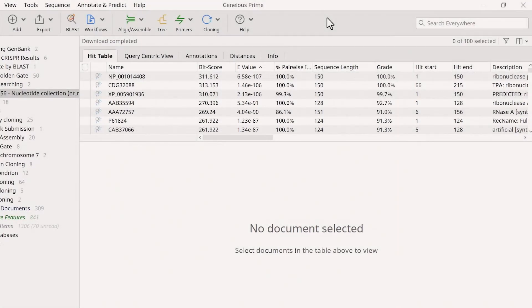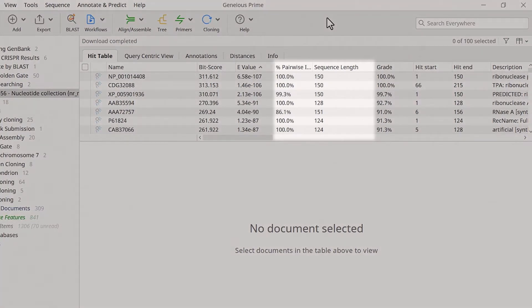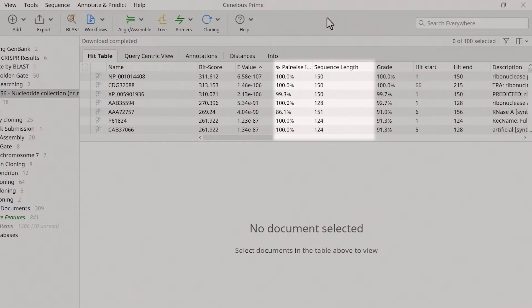As well as the e-value, Genius also reports the percentage pairwise identity, indicating how similar the sequence in the database is to the one you used as a query, and the BLAST hit length in base pairs under sequence length.